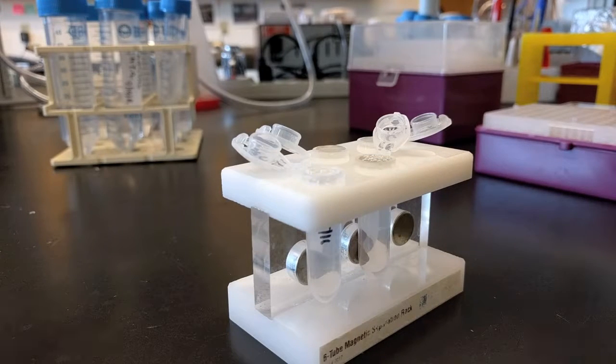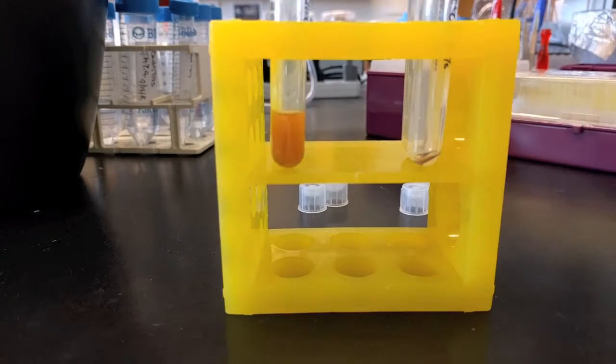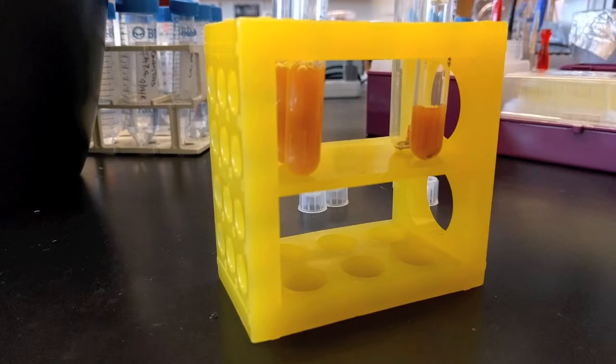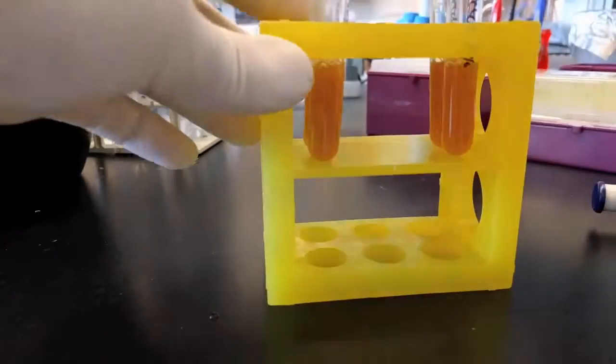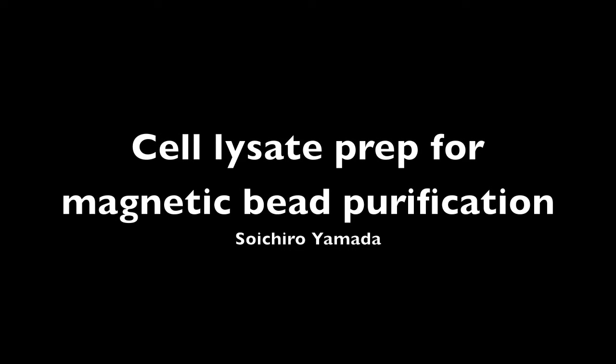The tubes are a little too small, so I placed them into snap cap tubes. Here I'm adding the cell lysates and re-suspending the particles, which have sedimented to the bottom. These lysates will then be incubated at 4 degrees in a rotator for a few hours.